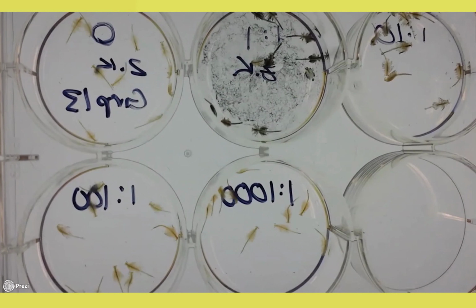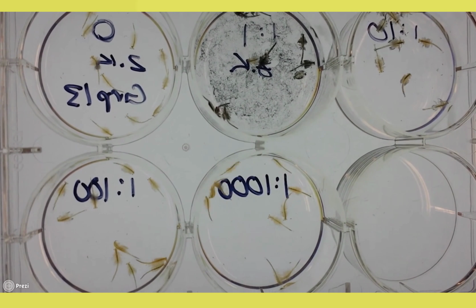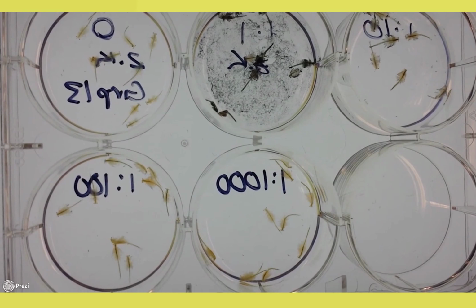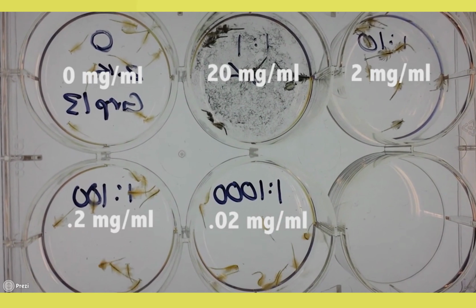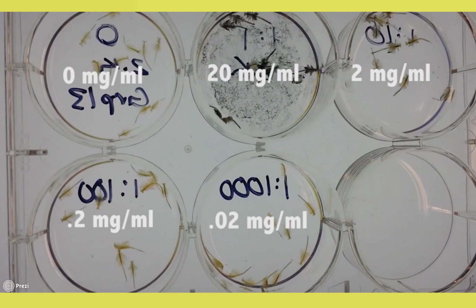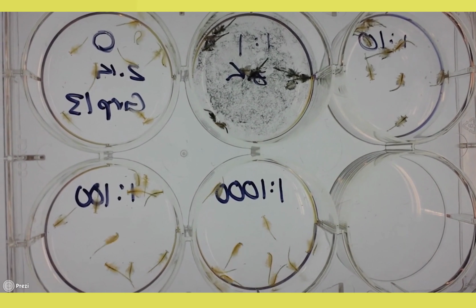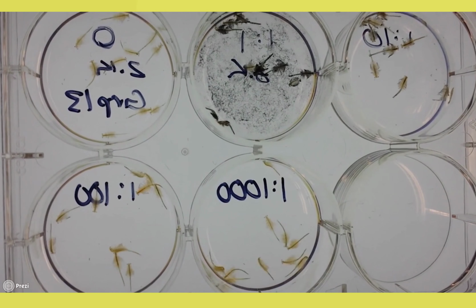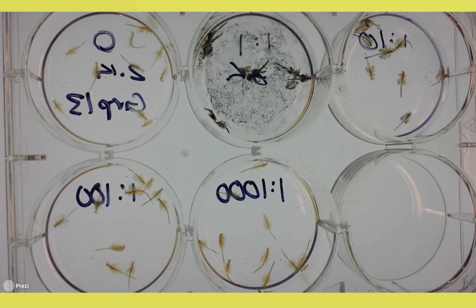This would mean that the concentration would decrease by a magnitude of 10 from the 1-to-1 solution all the way down to the 1-to-1,000 solution. So the 1-to-1 solution would have a concentration of 20 milligrams per milliliter, and the 1-to-1,000 solution has a concentration of 0.02 milligrams per milliliter. Each tube was then placed into a well with the corresponding concentration. All the wells included 10 brine shrimp at the beginning. The shrimp were then observed over the next 3 days, and the percentage alive was recorded for each day.